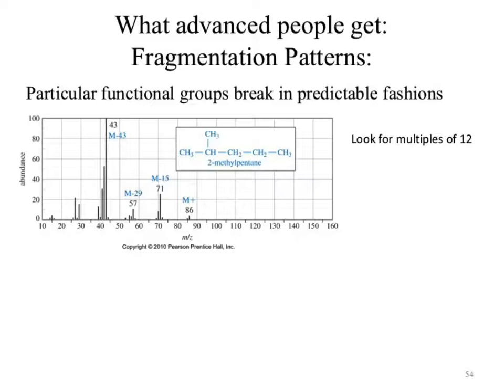Same deal for all these other peaks. We're telling you where that tallest peak is. In the analysis we just talked about, the only thing I mentioned was 86. What happens to the rest of the mass spec? Ignore it. Don't even need to worry about it.